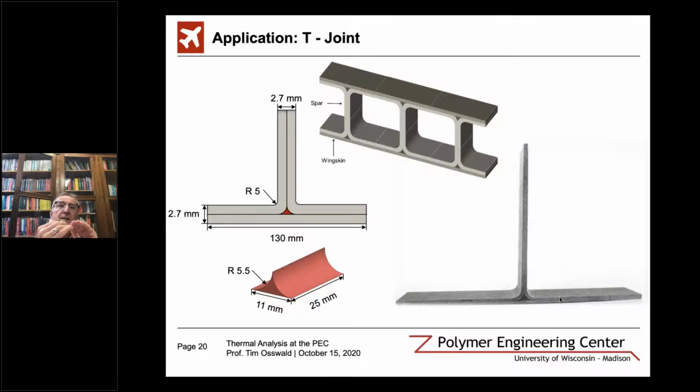As you heat up the UV cured part, it loses modulus, and so you want the curing to occur at just the right pace so that you don't warp or deform that part. At the end, they co-cure, creating a great bond between the DLS part and the prepreg.